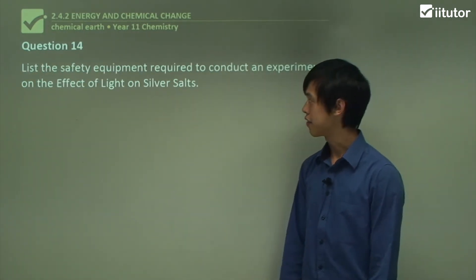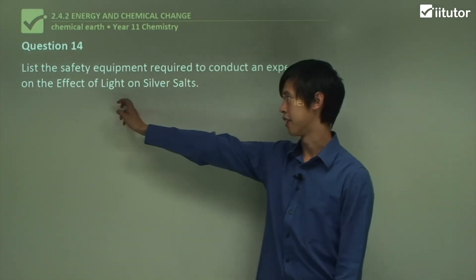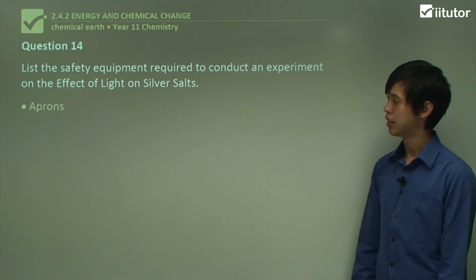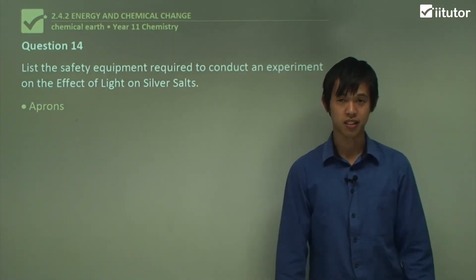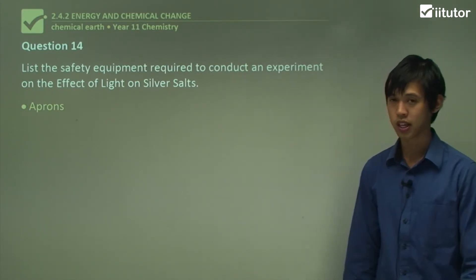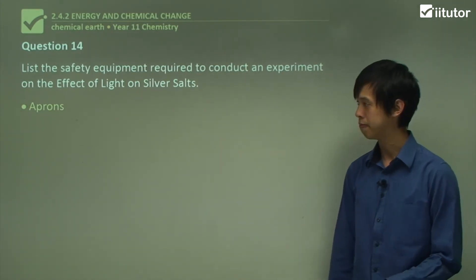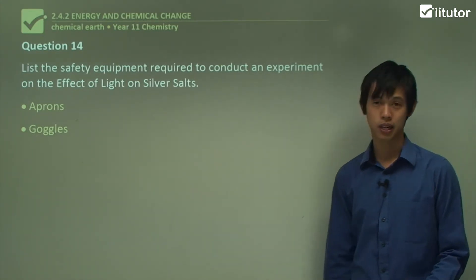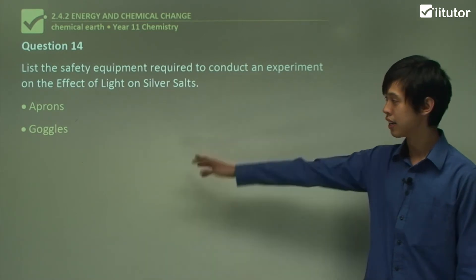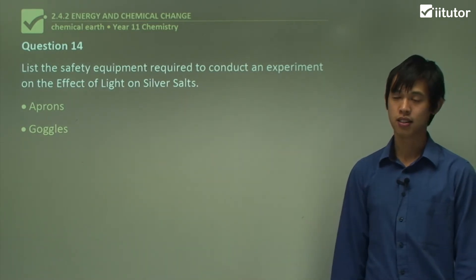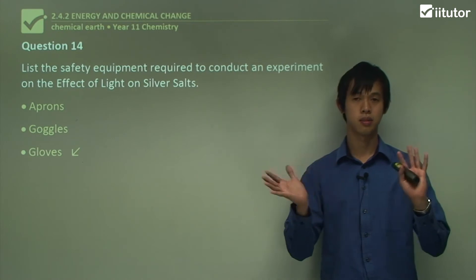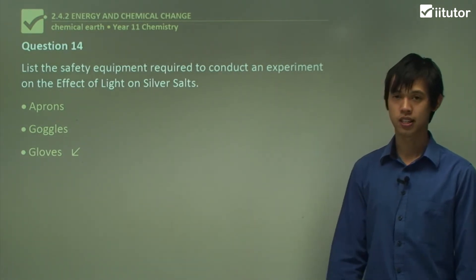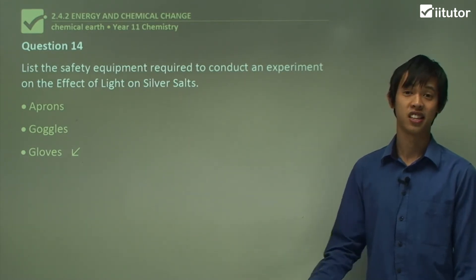Question 14: list the safety equipment required to conduct an experiment on the effect of light on silver salts. We definitely need aprons — we don't want silver nitrate on our clothing as it will stay there for a really long time. We need goggles in case it gets in your eye, and gloves to stop you from getting black stains all over your hands. That's basically all the safety equipment required.